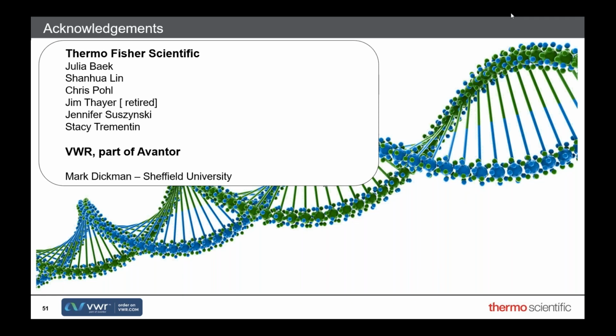So the first question for you, Ken: what is the LOD and the LOQ in the LC-MS method approximately? That's around slide 40. That's a difficult one. If you've got a big main product and you want to look at the impurity levels, the impurity levels we're seeing now are in the grass, so they're beyond what you could probably see with the UV and with the normal programs you use for deconvolution.